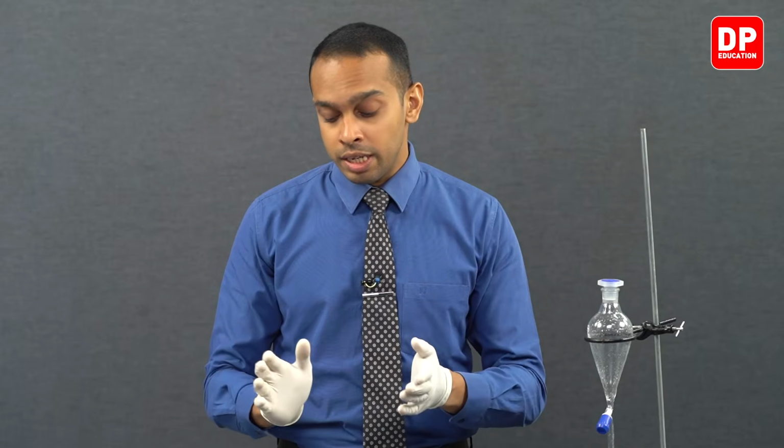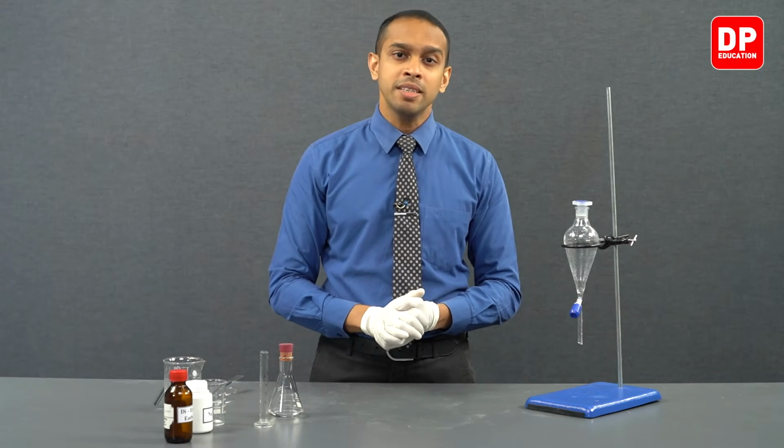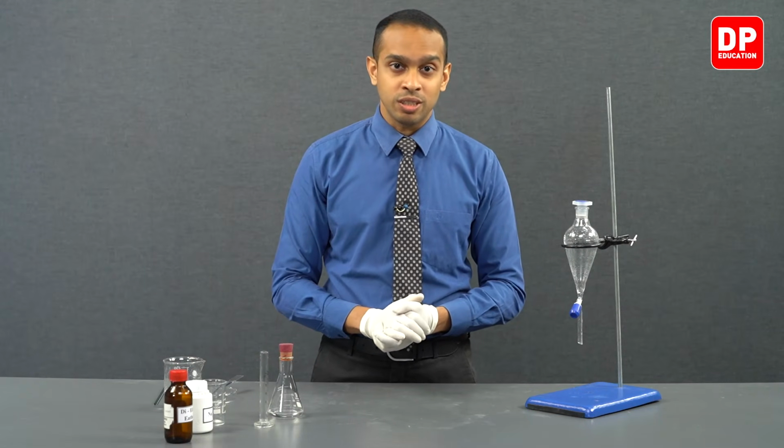So it is a requirement for us to remove these excess traces of water from this diethyl ether layer that we have over here. In order to do that, we can use a drying agent.